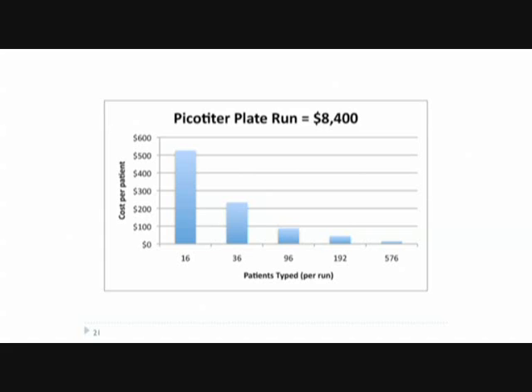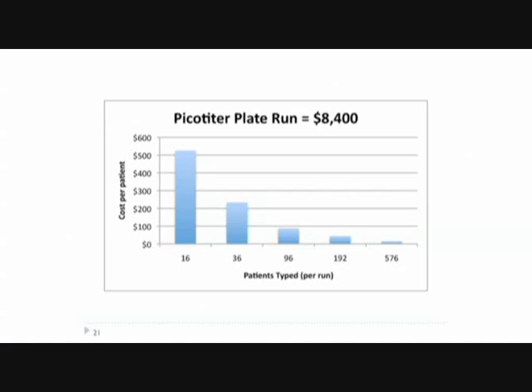We thought of adapting this to 454 because if we were able to eliminate the sequencing costs or dramatically reduce the sequencing costs, we might be able to generate the HLA types of patients much more economically than was possible in the past. So you can think of this entire project as we did it because we're cheap. And this just illustrates how, as you increase the number of patients who you study simultaneously in an instrument run, the cost of the sequencing per patient drops dramatically, such that if you have 192 or 576 patients, and this is about the scale that we're at now, the sequencing cost is measured in the tens of dollars.